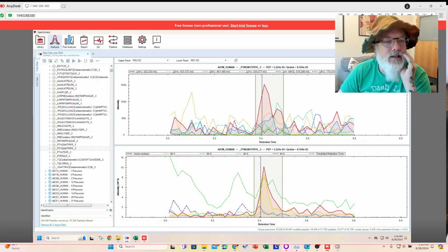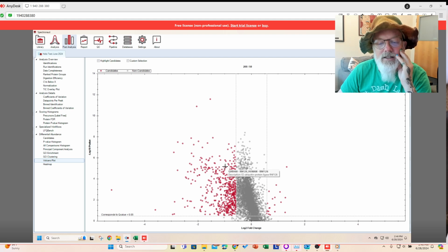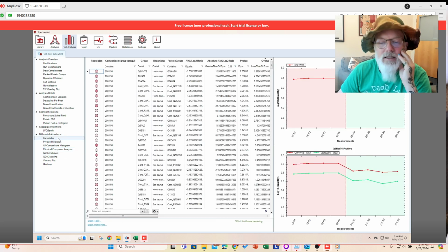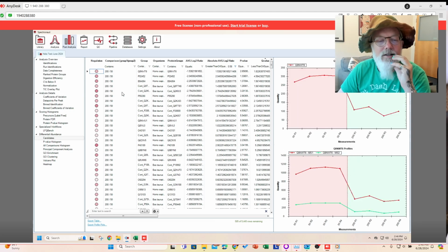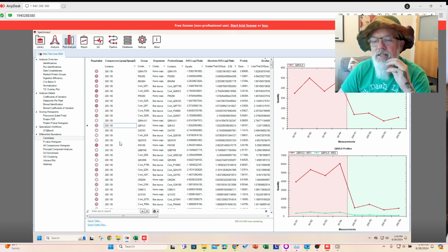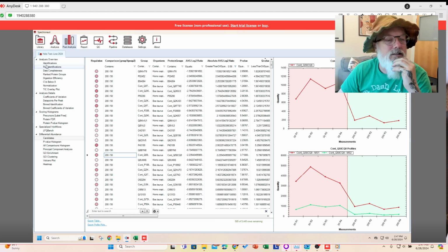And so before we do that, let's look at the volcano plots again. That looks a little better. Still a little bit skewed this way. That's the same, and you can see the candidates. Let's see, log scale. This should not be less in 200 than 50. So that's probably a normalization artifact. I don't know. Let's try it and see.